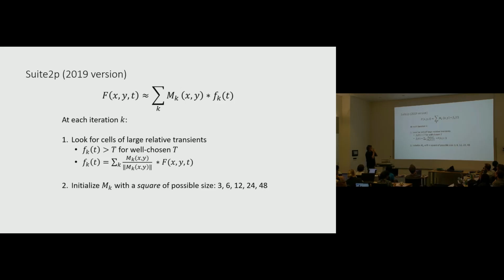But I'm only doing it for this one new cell that I've introduced, which makes the problem much easier than if I was optimizing all the cells together all the time. And so, yeah, optimize M given F, and then optimize F given M. This is roughly how people solve these matrix factorization problems when there's constraints: they keep fixed one set of parameters, right? Because there's two unknowns here. There's MK and FK, and we don't know either of them. So how are we going to solve this problem?